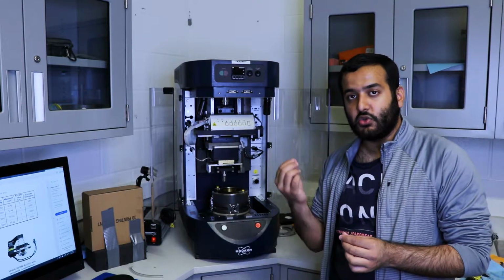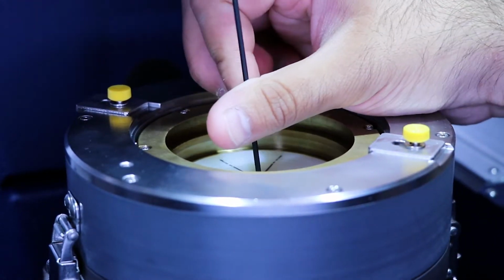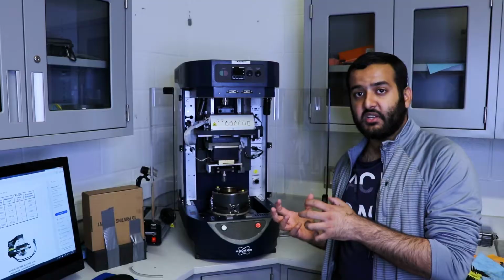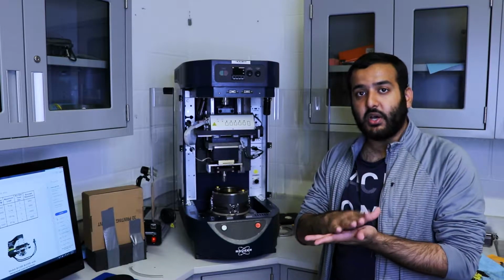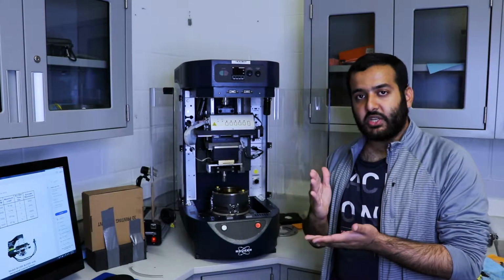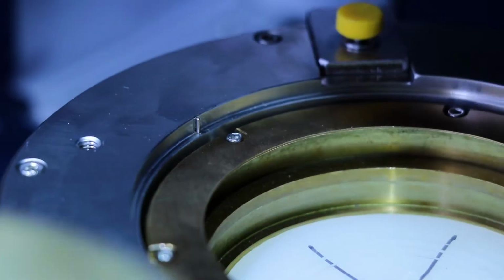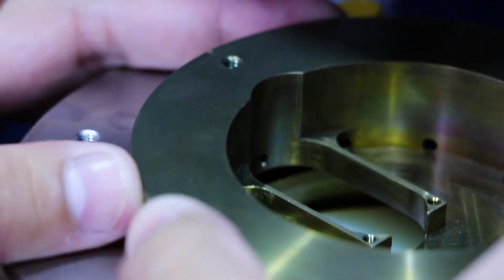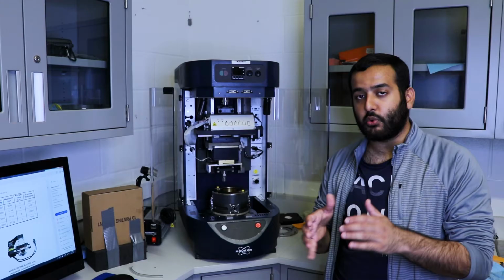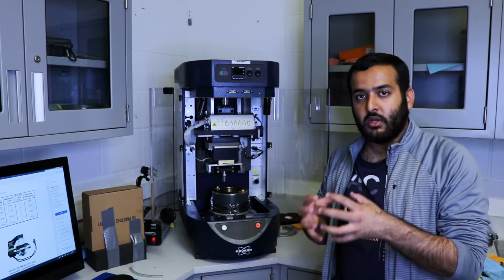Once you do that, you want to use a screw to secure your sample onto the actual drive itself using an Allen key. Make sure you test for the appropriate Allen key beforehand. Tighten it. Once it's tight, you can take the brass plate, put it back onto the sample. But you have to be careful because the brass plate has a little pinhole for aligning the brass plate to the actual drive. So very carefully line up the brass plate to the pin, which is at the edge of the actual drive itself. And once it's lined up, let the brass plate fall into place. Now it's a very, very tight fit, so you don't want to force and jam the plate in. You want to let it naturally fit into the actual drive itself.